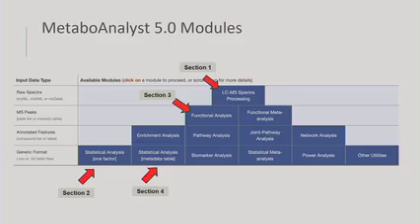And here is the overview of today's modules. We're going to talk about four: section 1 is raw data processing, and section 2 is simple statistical analysis, covering data processing and normalization. Then section 3 is functional analysis: how do we interpret the peaks into functions? The last one is complex stats, basically how to do covariate and multi-factor analysis.